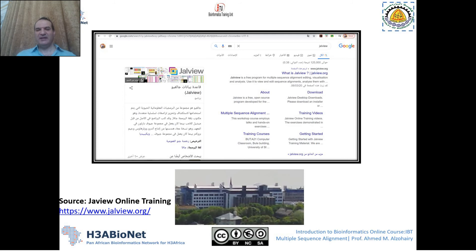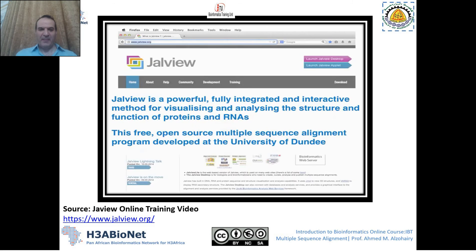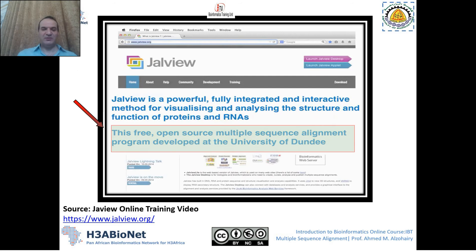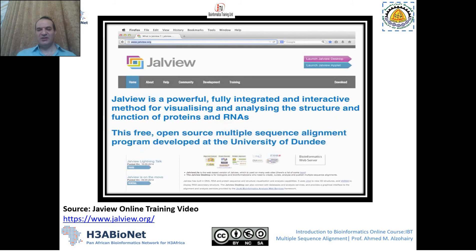You can easily Google Jalview and find the website at Jalview.org. It's a very powerful tool that works with analyzing and visualizing the structure and function of proteins and RNA. The good thing about Jalview is that it's free and open source for sequence alignment, and as mentioned, it is hosted at the University of Dundee.